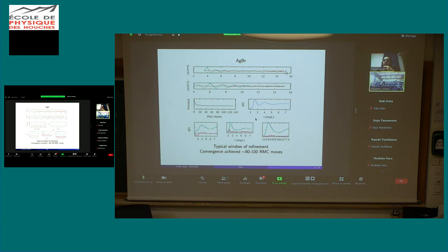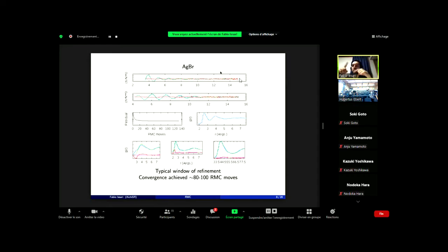So for example, in one particular unit cell, only one iron switches its position to cobalt and cobalt switches its position to iron. Mutual anti-site switching is what I'm talking about. But in this case, if you use a crystal configuration as the initial step, the configuration will actually move randomly. So unless it's a crystal, it will not remain a crystal.